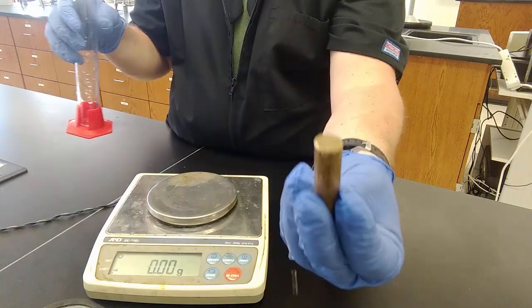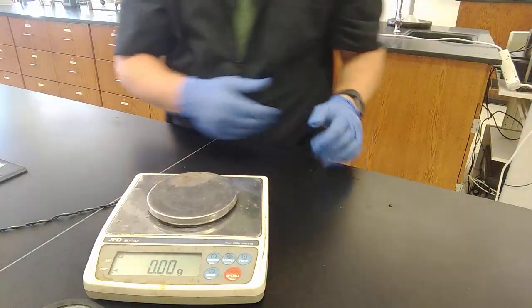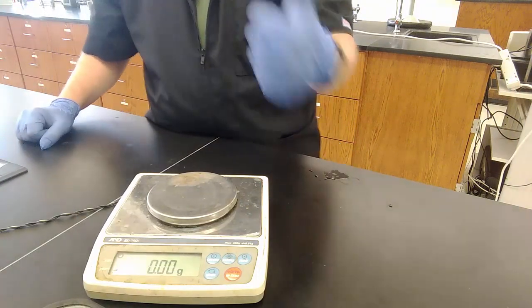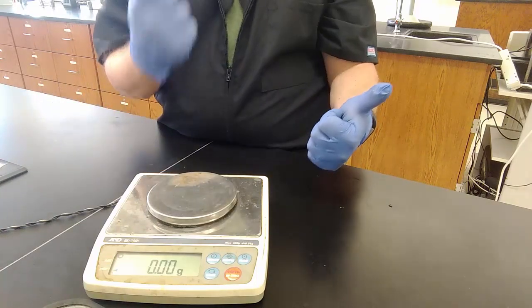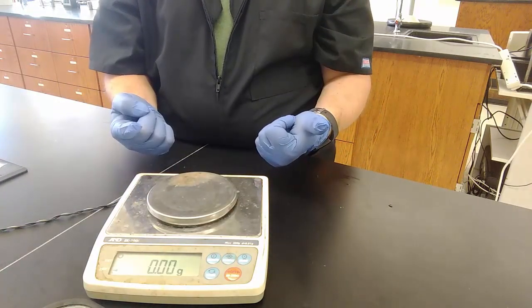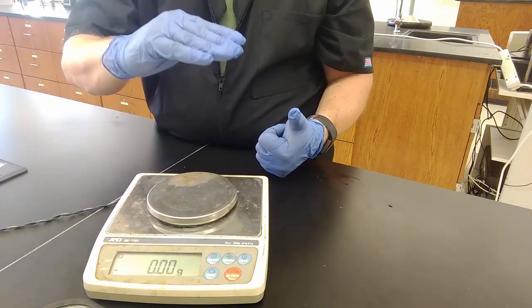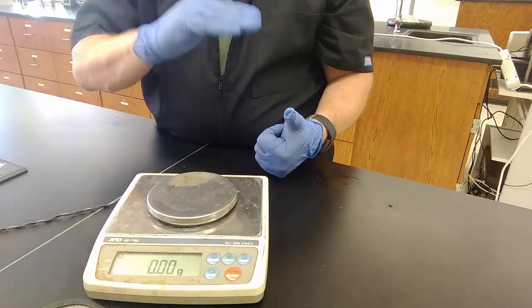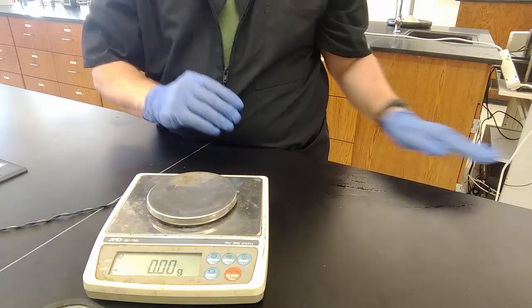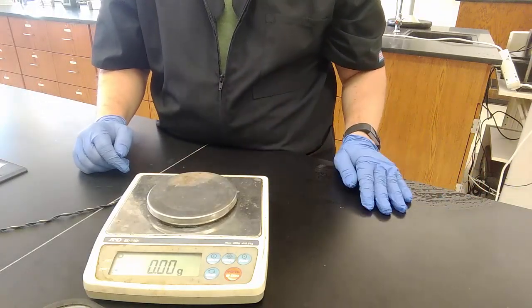And I have my bar to put back after I dry it off where I got it from. Then we can calculate the density of the bar because we have its mass and we have its volume. Think of the definition of density: mass per unit volume, mass divided by volume, mass over volume. There's a lot of different ways to say it, but a lot of times in chemistry, the unit will tell you how to do the problem.